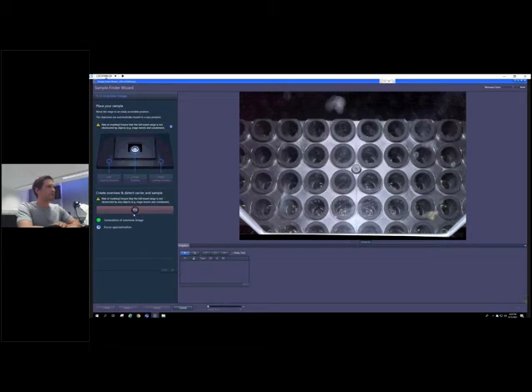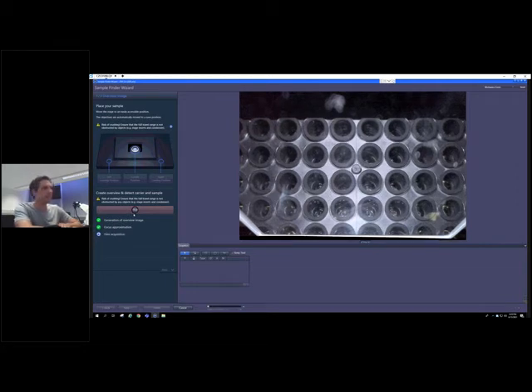Now we will have another round of reflected light illumination and detection with the small camera, which is mounted next to the objective turret. And the first neural network is now identifying that in this case, we're not working with a slide. Therefore, it chooses to go with another strategy. And the strategy which is being executed now is just a tile scanning using this reflected light illumination and detection.